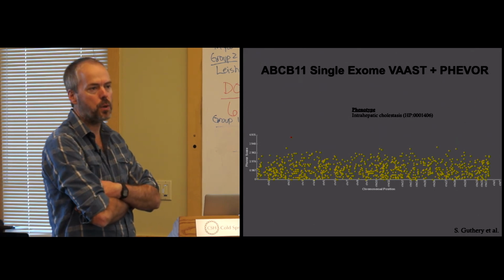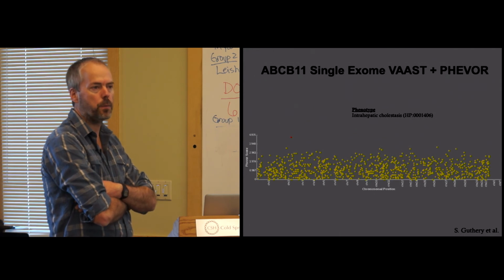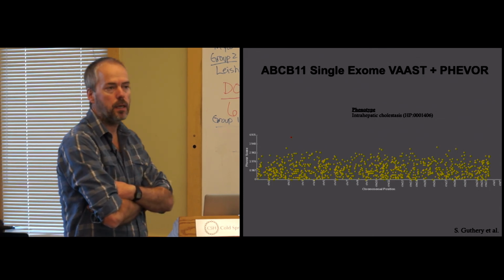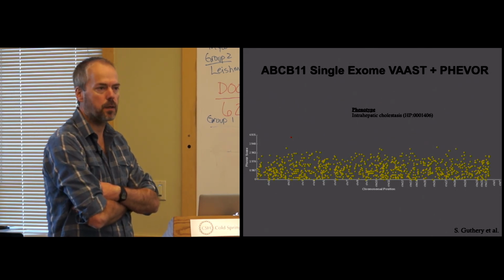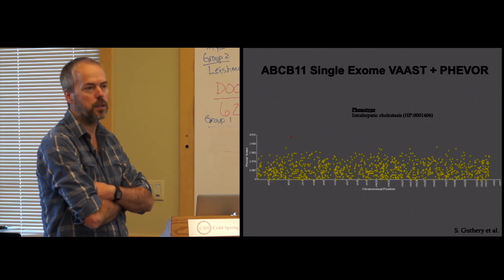So you come to it with some kind of a preformed opinion about what the phenotype that you're looking at is. I mean, you certainly could have put in any of those phenotypes, and this gene would have been weighted up, because I think all of those would be associated with this node in the ontology.